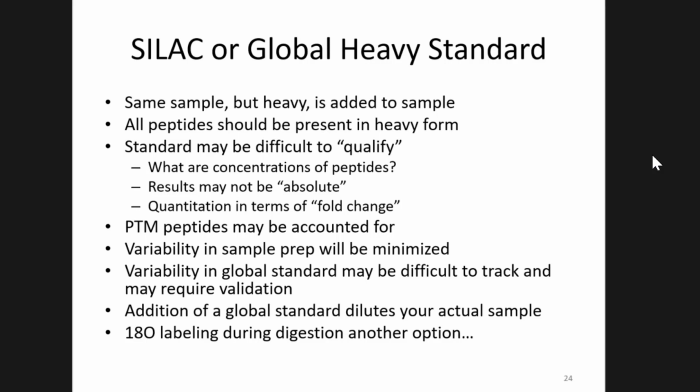So anyway, another option, if you can't purchase things like synthetically labeled isotopic standards, are these proteome standards. If you can make SILAC labeled cell lines, or if you can do a heavy water digest and make a bunch of it, this is something you could always spike in with your sample 1-to-1 and see what you get. The downside of that is you are making your sample potentially more complex because you're not just spiking a peptide in, you're spiking a proteome into it.